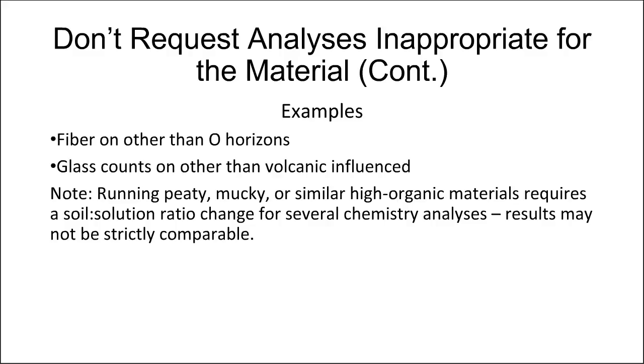And a note here, running peaty, mucky, similar high organic materials requires the soil solution ratio to be changed for several of the chemistry analyses, and the results may not be strictly comparable. What is happening is that a soil solution ratio intended for mineral soil has to be changed to add quite a bit more solution because the organic material soaks it all up and you've got nothing to analyze.